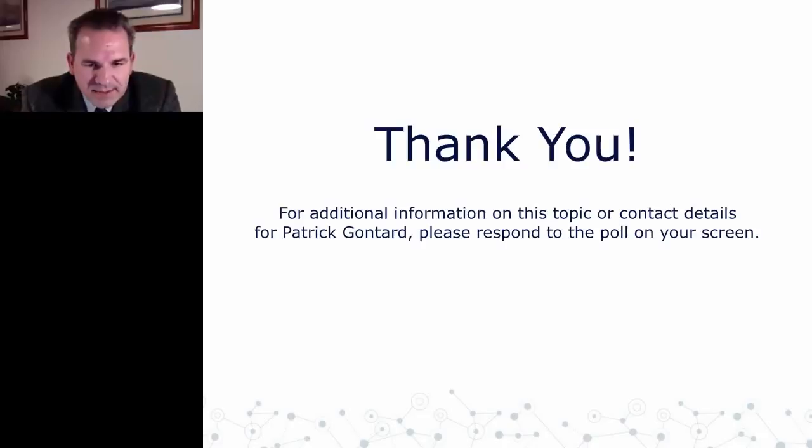Once we have reached that, we can show impact. I manage a group of laboratories that are $100 million and over in revenue, some of them much larger, and most of them, if not all of them, have multiple production sites with multiple ecosystems of informatics. And we see the impact of one informatics against the other, because it's not easy to unify. It takes a few years to unify the ecosystems through the middleware. Changing an LIS is an endeavor that takes at least 18 months if it's planned very efficiently.